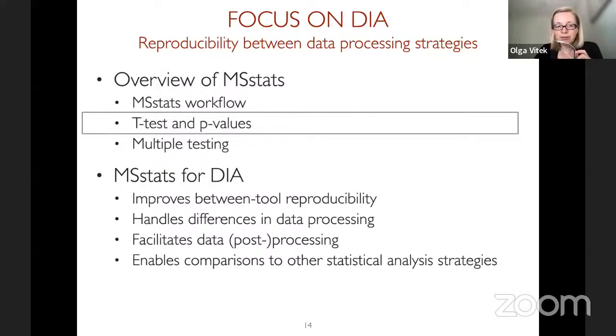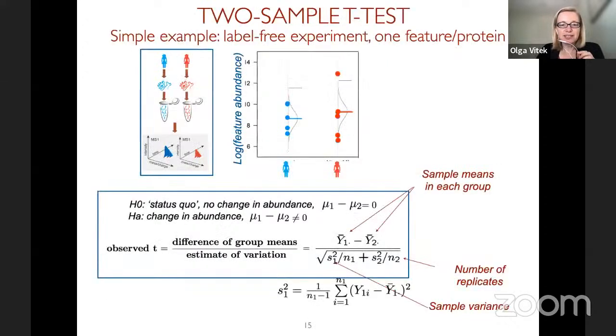I know that many of you have seen that and are familiar with that, but I also noticed that frequently we use these terms without really being on the same page of what it actually means. And just for the sake of making sure that MSstats is used for the right question, I will go ahead and review very briefly t-test, p-values, and multiple testing. And then I will talk more specifically about MSstats for DIA.